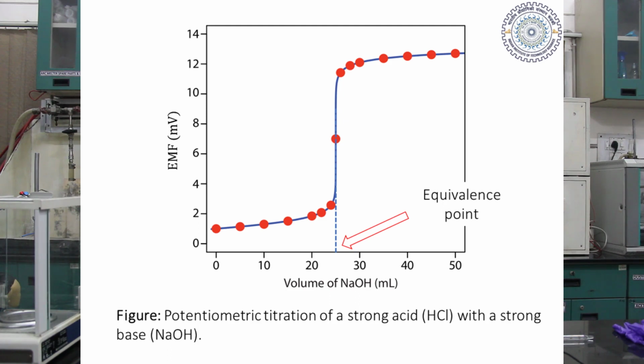And there is a sharp increase at the end point, and again after the end point there is an increase in pH, which again increases the EMF of the solution.